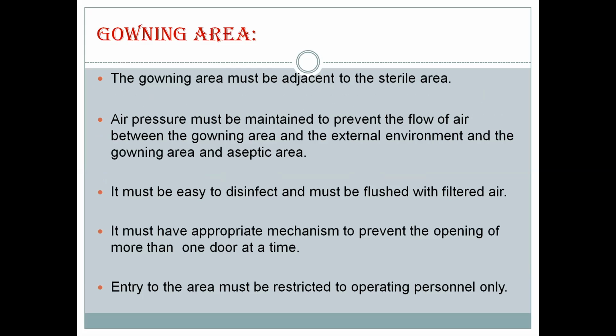Then the gowning area. That means wearing gowns in the sterile areas, aseptic areas. The gowning area must be adjacent to the sterile area. The air pressure must be maintained to prevent the flow of air between the gowning area and the external environment.